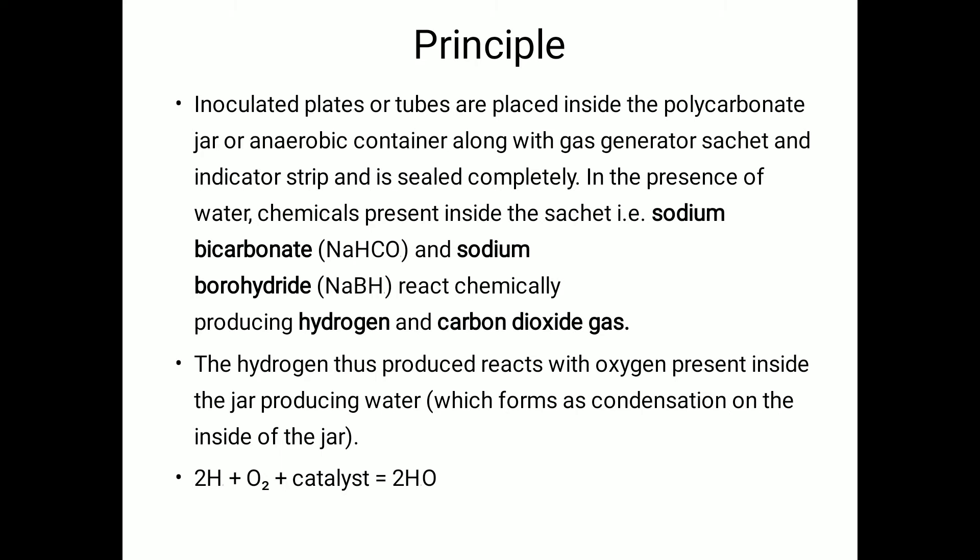The chemical reaction produces hydrogen and carbon dioxide. The hydrogen thus produced then reacts with the oxygen present inside the jar, producing water, which forms as condensation on the inside of the jar. This reaction is catalyzed by the element palladium, which is attached to the underside of the lid of the jar.